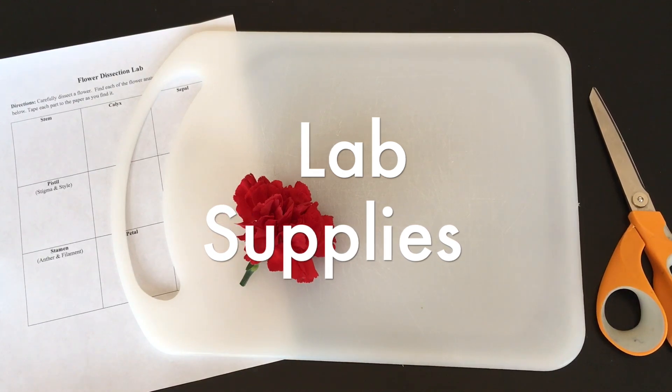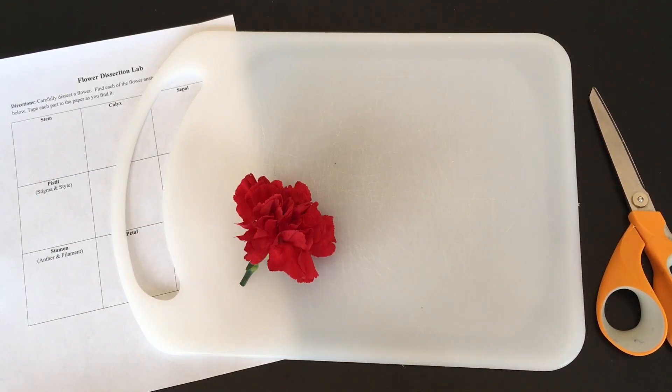Let's start off with supplies. You need a flower for each student or group of students. While all complete flowers will have the anatomy students are learning, there are a few flower varieties that are more user-friendly to see the flower parts easily. Lilies work well. I'm going to be demonstrating with the carnation. I recommend these flowers because they're inexpensive, easy to find from any florist, and very easy to find the anatomical parts. The best news is that your students won't need a scalpel — a pair of scissors is sufficient. So each student has a flower and a pair of scissors, and this flower dissection lab worksheet is also going to be helpful in the lab.